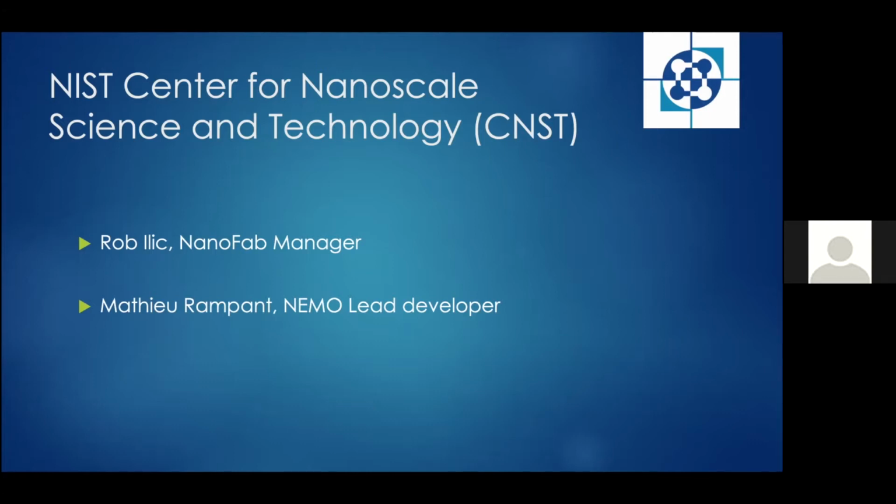There were some limitations of Coral. It didn't have billing, so a lot of times at the end of the month we would download the data and then upload it back to DTR to generate journal vouchers and so on. Apparently here at NIST, in its early days, the CNST NanoFab utilized Coral as well.